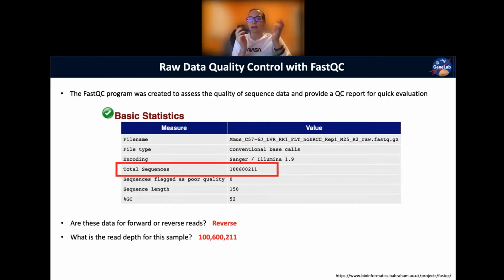And so I usually do that when I have to combine files together to have one set of FASTQ files per sample. I usually do a check on how many lines were in each file before I concatenate, and then after I concatenate to make sure everything was combined together correctly. And so you can know the number of sequences that you have based on the number of lines, just dividing the number of lines by 4. So that's why I wanted to bring that up.